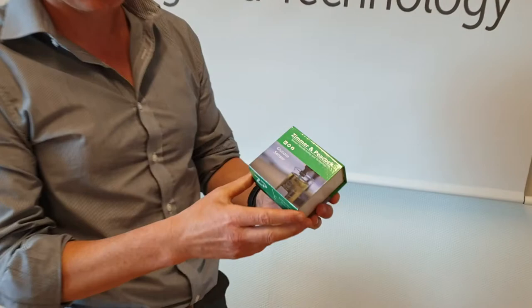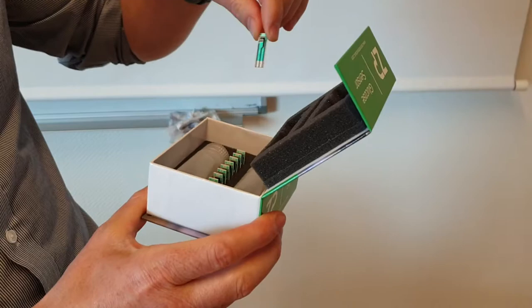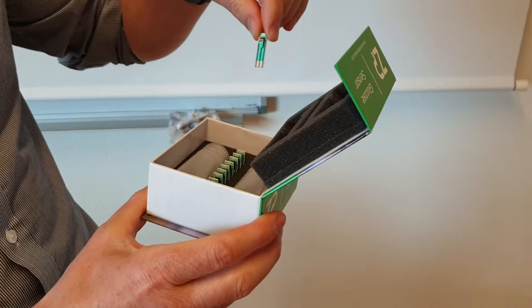This is a quick introduction to a new product bundle — the glucose sensor bundle from Zimmer and Peacock. Inside you'll find 10 glucose sensors. If you're looking for the electronics, contact Zimmer and Peacock or Google it — we will have the electronics available.